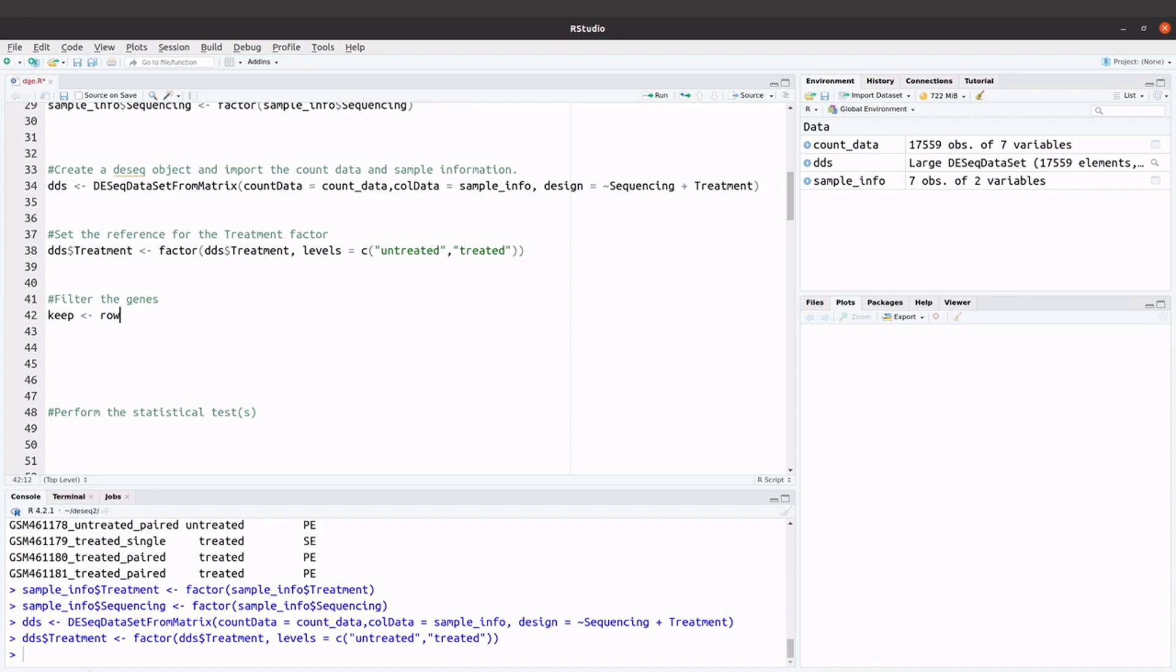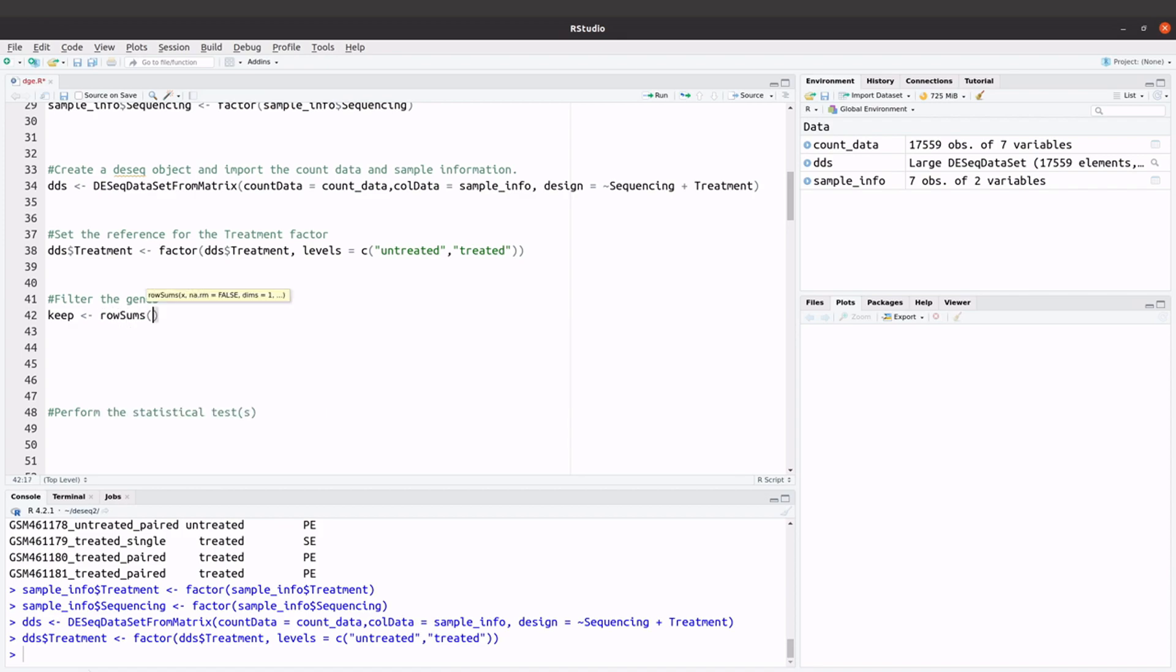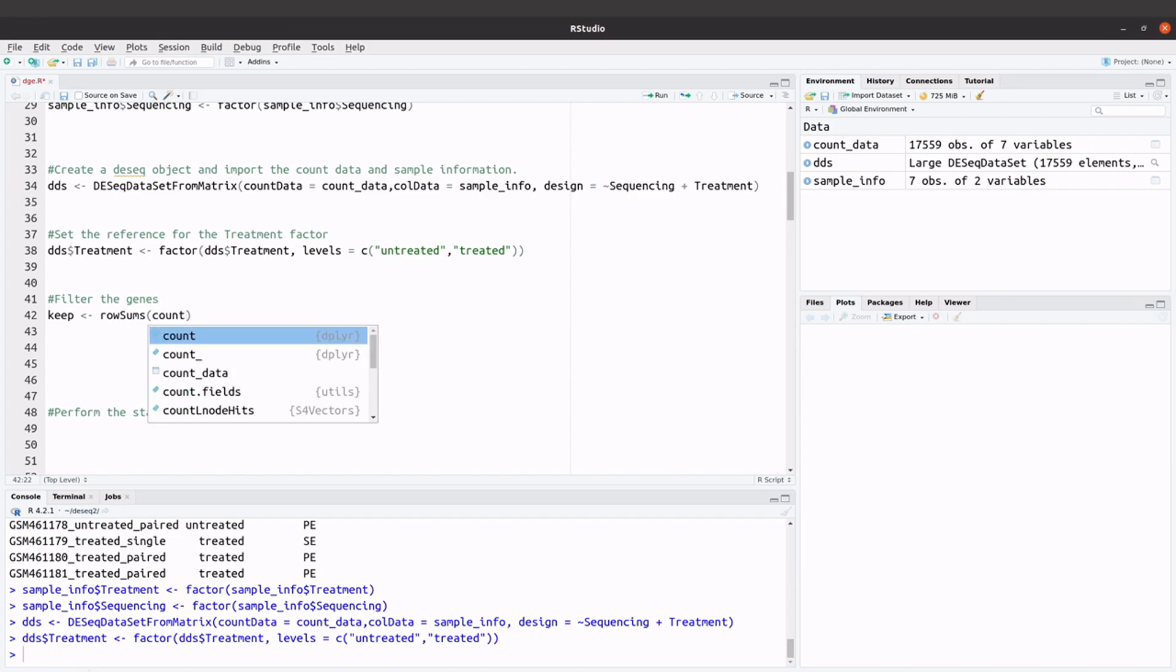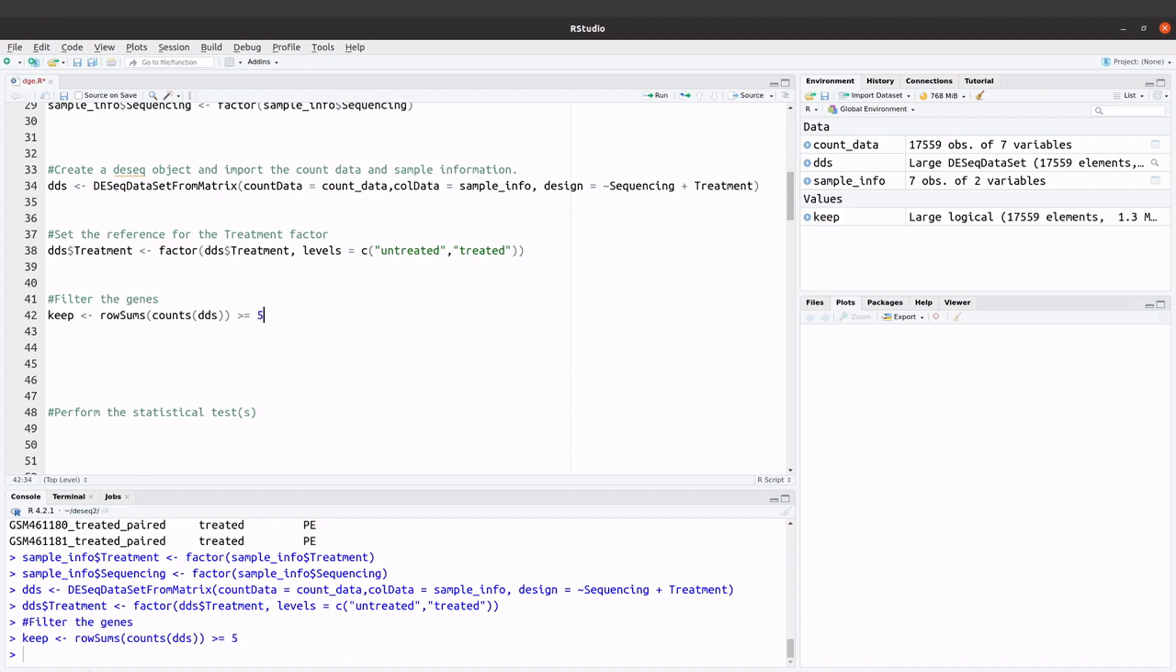And I'll say rowSums. I'll say counts(dds), now say greater equals to 5, greater equals to 5. So I'll issue this command.